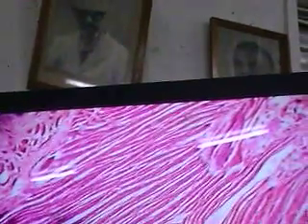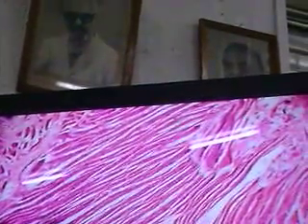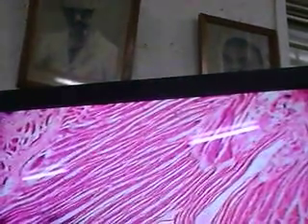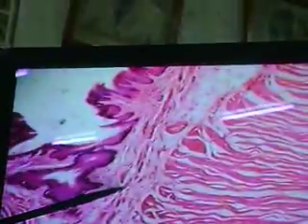In some of the animals, we see some sort of a development of a sphincter. But in man, there is no thickening of the inner circular smooth muscle. There is no true anatomical sphincter occurring here. So there you can see the lower third of the esophagus: the outer longitudinal and inner circular layers, the submucosa, and the muscularis mucosae.